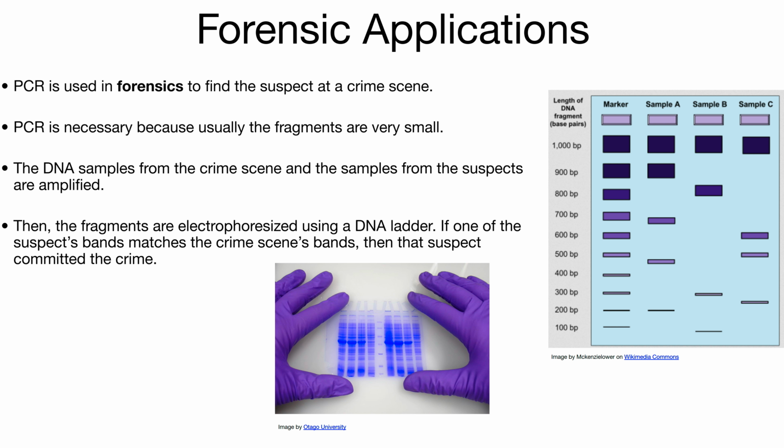So on the bottom, you can see 2 of these samples match. You can see the 4th and the last sample match. So they're almost exactly in line with their DNA markers. Matching doesn't mean perfect matching. It means that it's either perfect or almost. They're like almost.